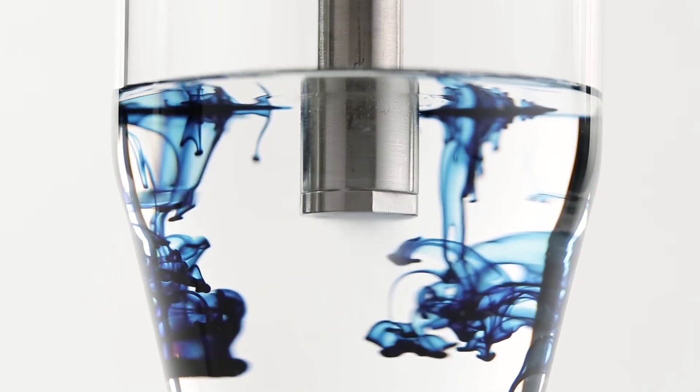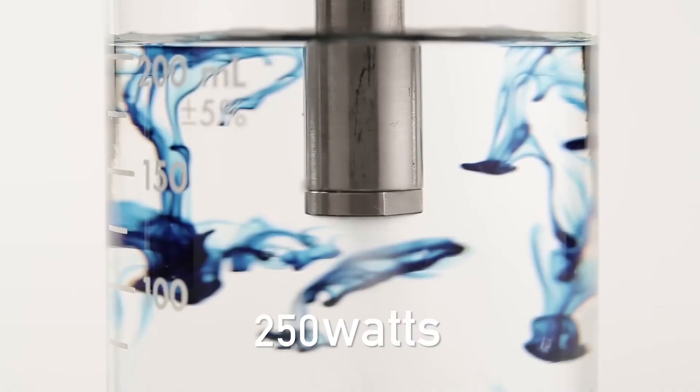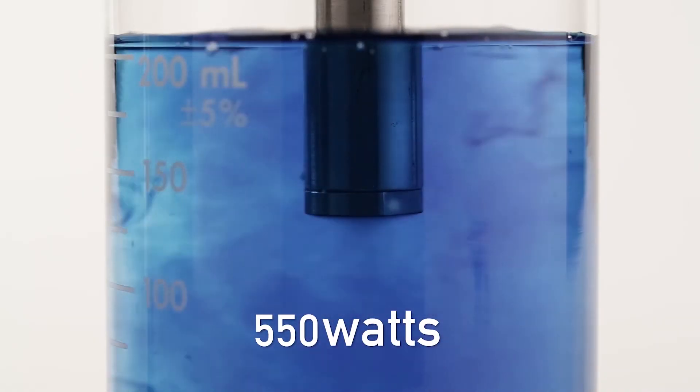Our new digital models are also more powerful, delivering up to 550 watts to handle large volumes and viscous solutions.